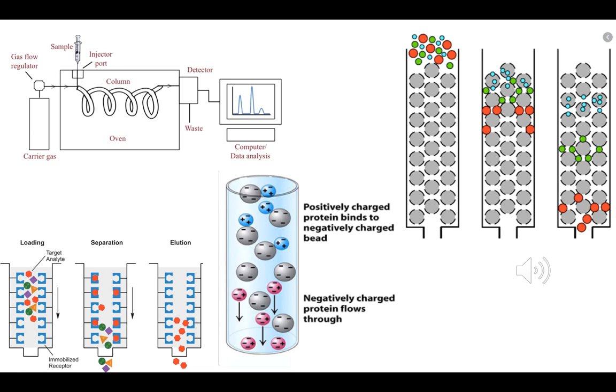There are some other types of chromatography that we should talk about. One is size exclusion chromatography. Basically, it's a column with beads that have holes in them, and you put a liquid into the column and it separates based on size. The big compounds go past the beads and leave fast. But the smaller molecular weight compounds get stuck in the holes, so it takes a little bit longer for them to get out.